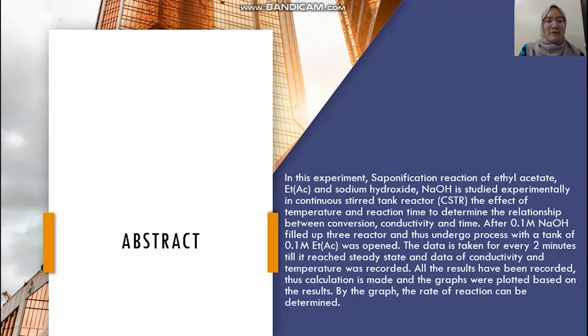The effect of temperature and reaction time is studied to determine the relationship between conversion, conductivity, and time. After 0.1 molarity sodium hydroxide is filled in 3 tanks, it will undergo the process with a tank of 0.1 molarity of ethyl acetate.